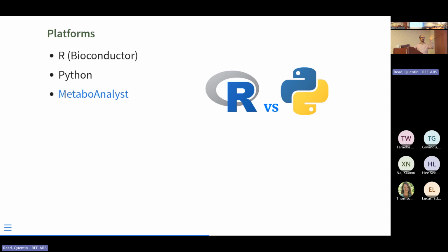So if you have a special model you want to use, you don't have to switch your whole software environment. There are also a lot of graphical interfaces for omics analysis, like MetaboAnalyst, an online point-and-click platform for doing omics analysis. Most focus on metabolome, but you can do other stuff with it. It runs R in the background, and you can get R code out of it.